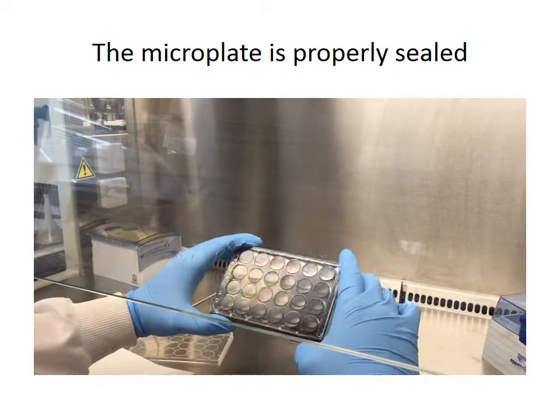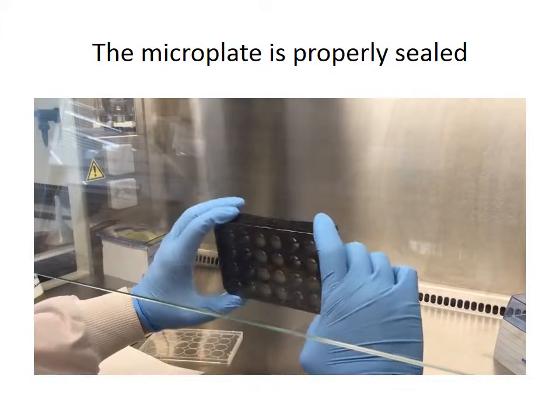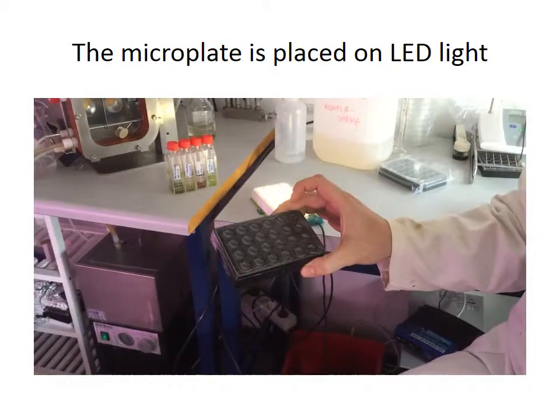We are now rotating the microplate to be sure that the breathable membrane was placed properly and that there is no leaking of liquid from the microplate.